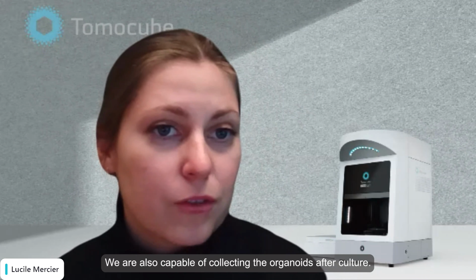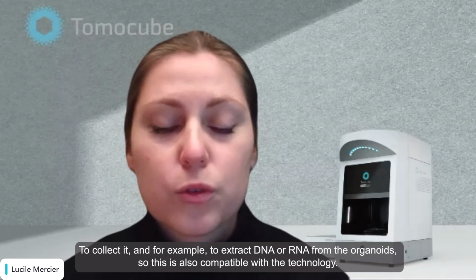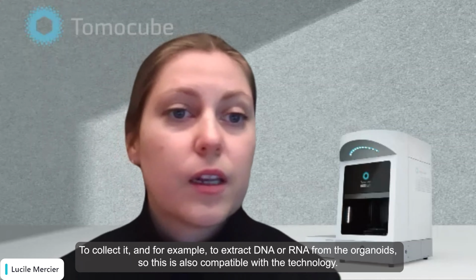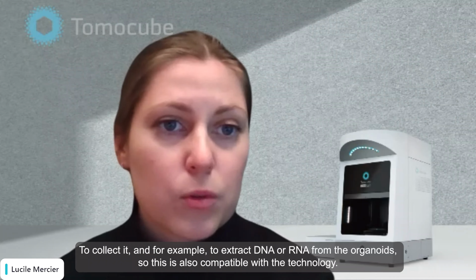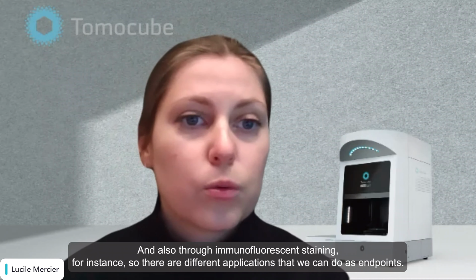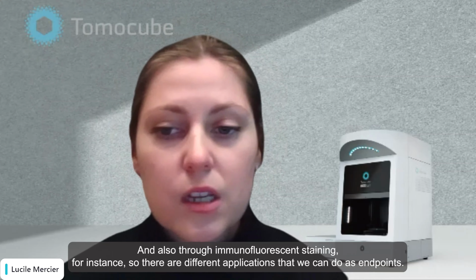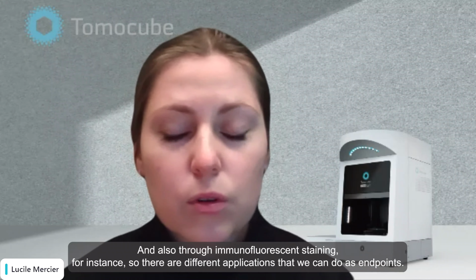We are also capable of collecting the organoids after culture, for example, to extract DNA or RNA from the organoids. So this is also compatible with the technology, and also through immunofluorescent stainings, for instance. So there are different applications that we can do as endpoints.